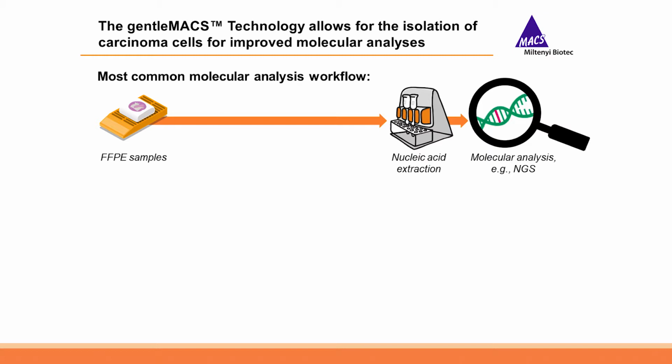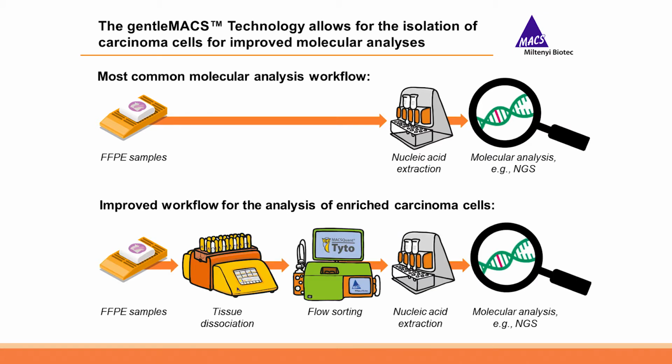Here I'd like to present once more the classic molecular workflow. You prep the DNA from a complete FFPE section, you extract it, and then you do molecular analysis. But if you're really interested in the tumor signal, it is very important to enrich the tumor cells.